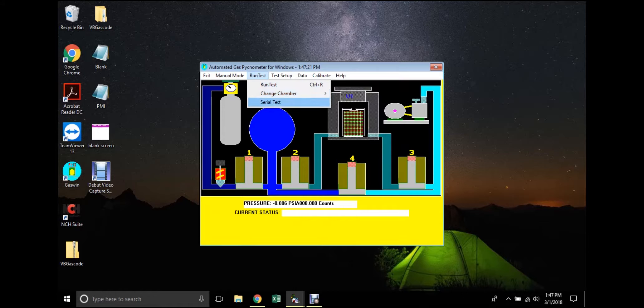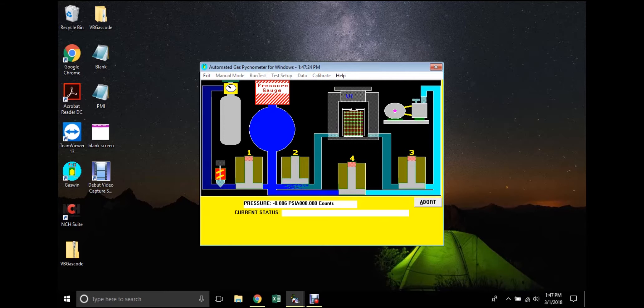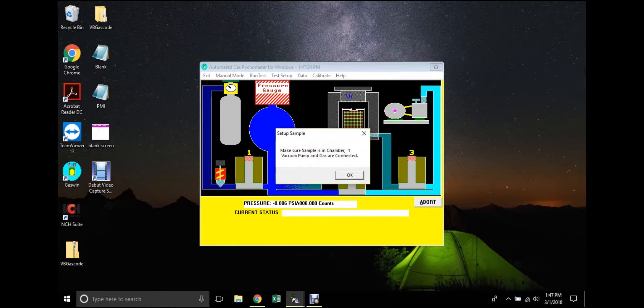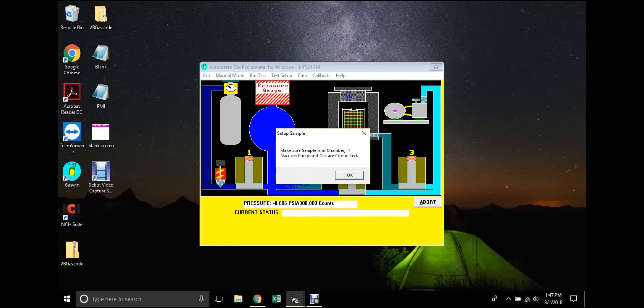The software will then prompt the user for assurance that a sample is present in the sample chamber and that the vacuum pump and a gas supply are both connected. The user then clicks OK and a test setup window will open.